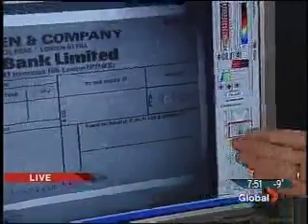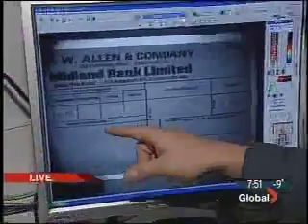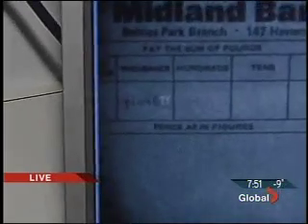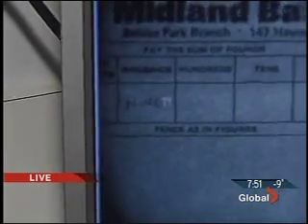Different kind of ink? Absolutely. In this case, it's reacting differently from the genuine ink or legitimate amount for 9,000. You can see over here, they've actually put in the TY to make it look like 90,000 instead of the 9,000 pounds that was originally intended. This happens all the time. Silly gooses. They're not going to get away with that. No. Well, that's why we're here, to make sure everyone's doing things right.